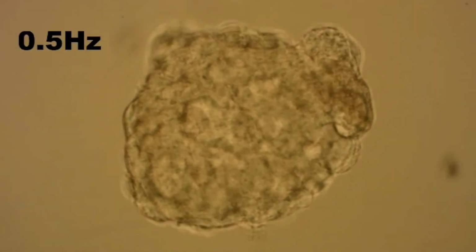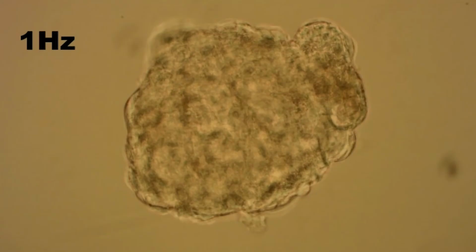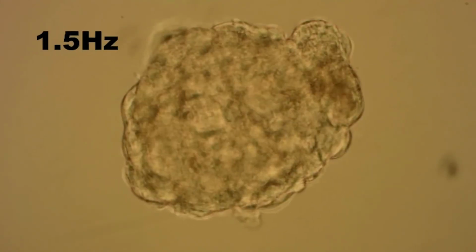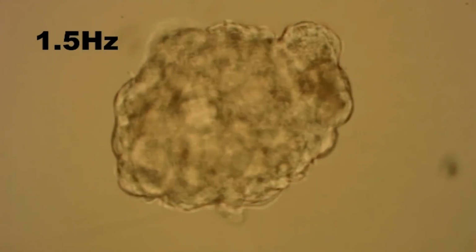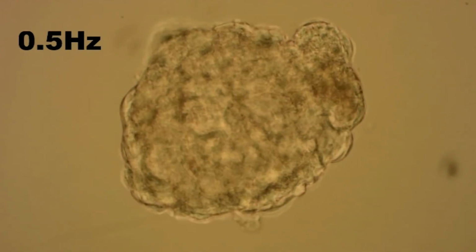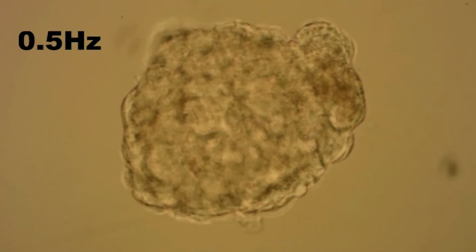So an example of our work is shown here with these cardiac microtissues, which are formed from the 3 different cell types that we mix together. And you can see that these pulsate with a regular rhythm. They're about 100 micrometers in diameter, so they allow us to manipulate them and add drugs and see changes in structural and functional parameters.